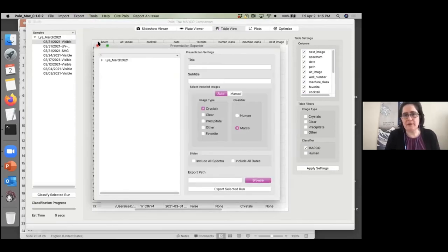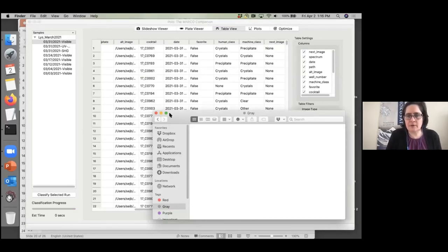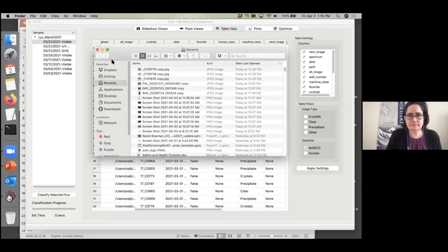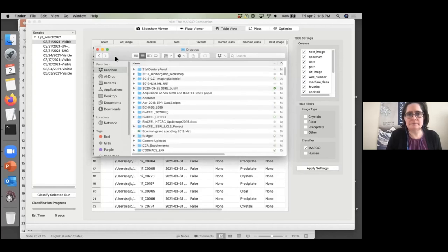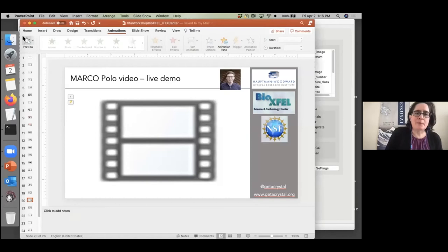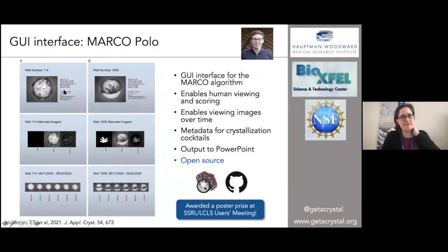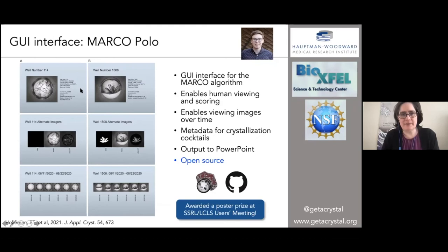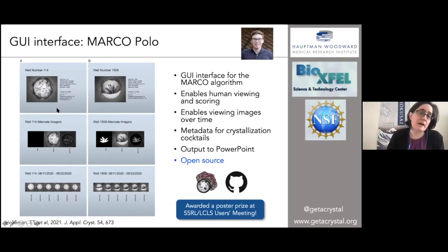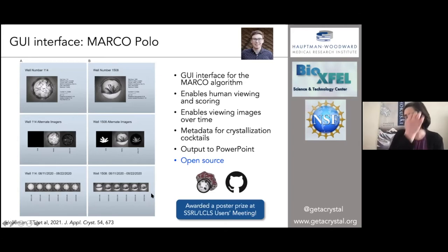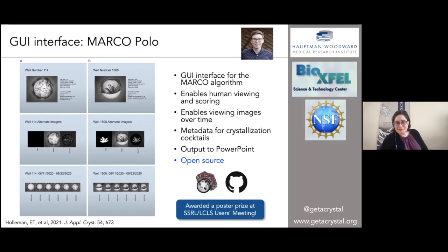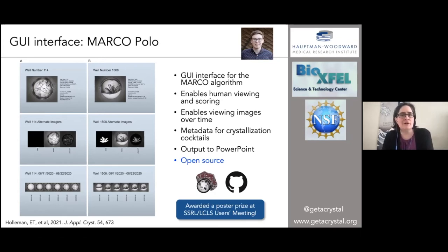When you export it as a PowerPoint, you get to select what you want to export. The PowerPoint export looks just like this — it's a really nice way, if you're working with collaborators, to very easily show that you're generating crystals, what the conditions are, that you have multiple different types of images, and you can watch it over time. All of these things are completely built into the Marco Polo GUI. We're pretty excited about it, and hopefully it'll make high-throughput screening a little bit easier and easier to then optimize.